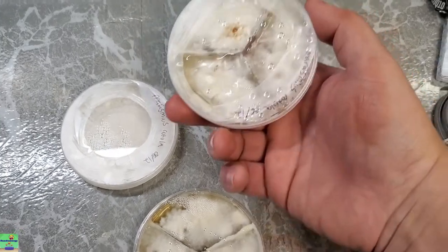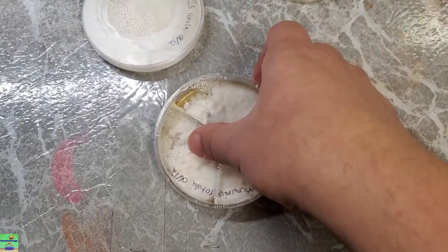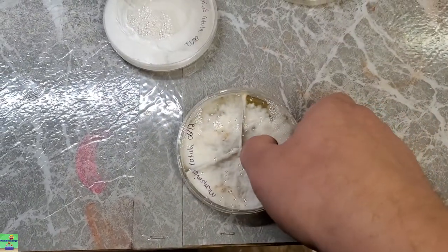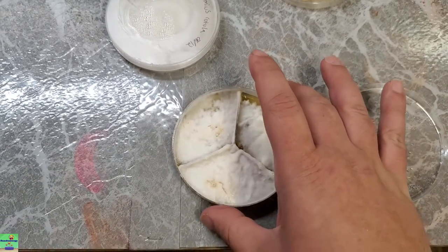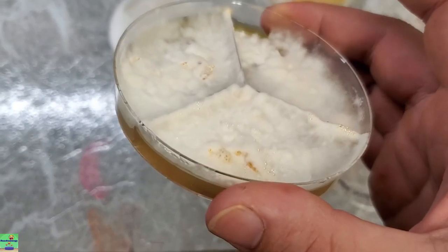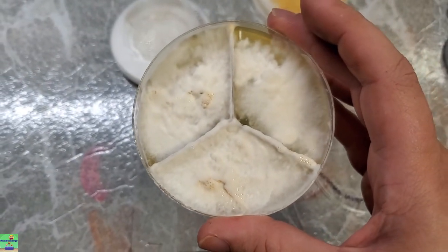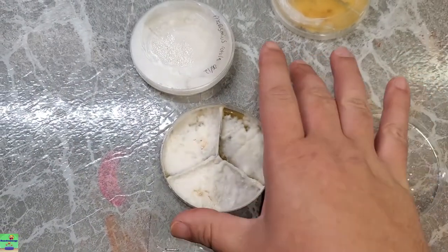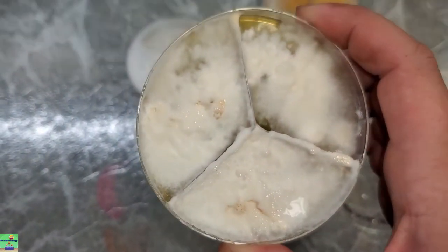I'm not going to include it in this video, I'll do it in a separate video, but I'm going to see if I can fruit these and have them put off little tiny mushroom fruiting bodies. Because they're so small, they should grow right off this agar, no problem. They don't need a whole lot of nutrient. Let me turn the flash on my camera. There, that way you can see a little bit better detail.